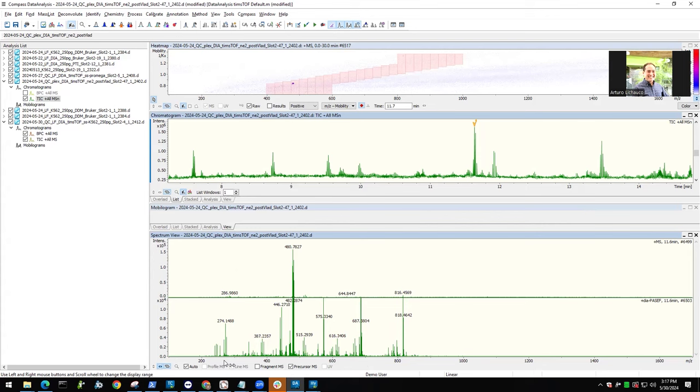The way you do the analysis here is you use MS2 for identification, and you use the MS1 level then for quantitation. Because then you don't run into this issue that you use a certain fragment which might be representing all three peptides, or you have to find those fragments that are unique to a certain mTRAQ label. So that's why you do the MS1 based. Yes, correct. But you wouldn't run this in DIA, because then you have the issue that you have multiple precursors in the same isolation window, then you can't really track back to where those fragments or the reporters were coming from.